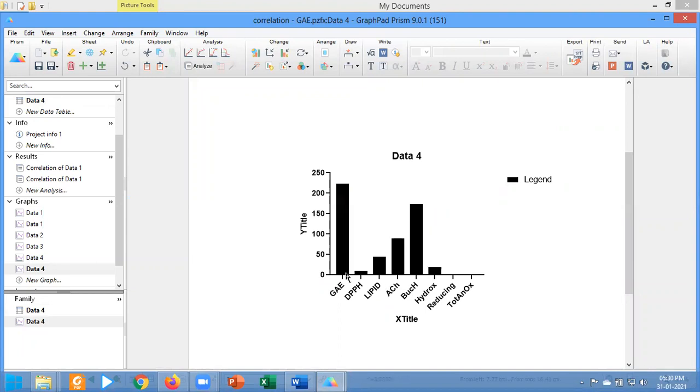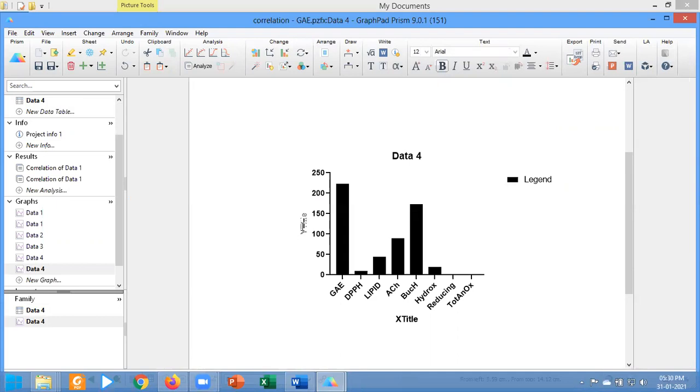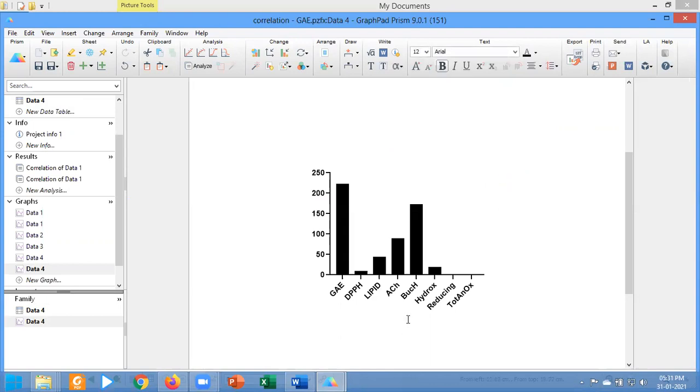Now I am going to apply the result for the Pearson correlation within this data. I am going to omit this Y title, delete this data option, delete this legend, and delete this title.